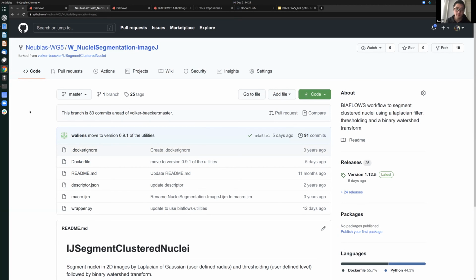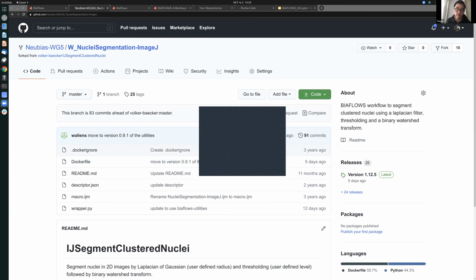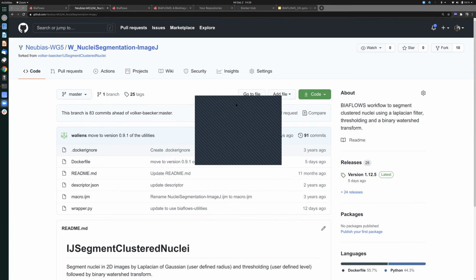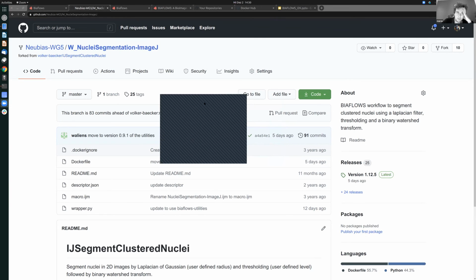And just a naive question: do we have to use DockerHub, or can we use local Docker servers, or can we use Git, and also can we use GitLab instead of GitHub? So for the moment, we are only using DockerHub, but that's obviously one thing that we want to work on very soon. It's to allow local Docker servers, because you will notice during the hands-on it can take some time once you want to build a new image on DockerHub.